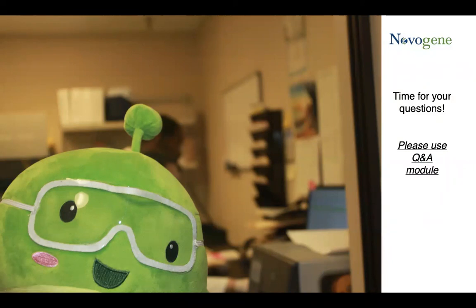Thank you for your question. Currently, Novogene bioinformatics software is not available to our customers, but we do have some cloud platforms that customers who choose to do analysis at Novogene can log onto and do some custom analysis using our cloud platform, where we have our analysis software plugged in. So maybe this is one way that you could use the analysis software we are now using.